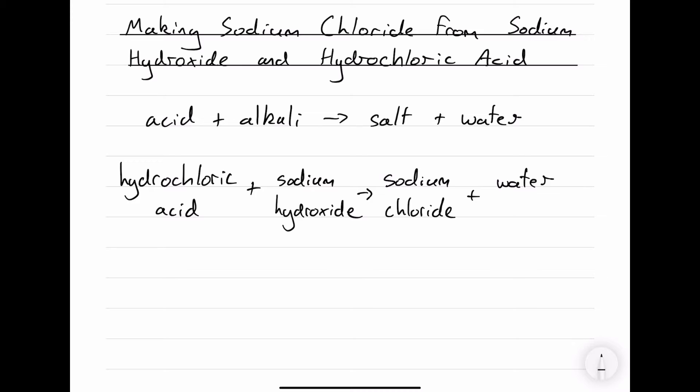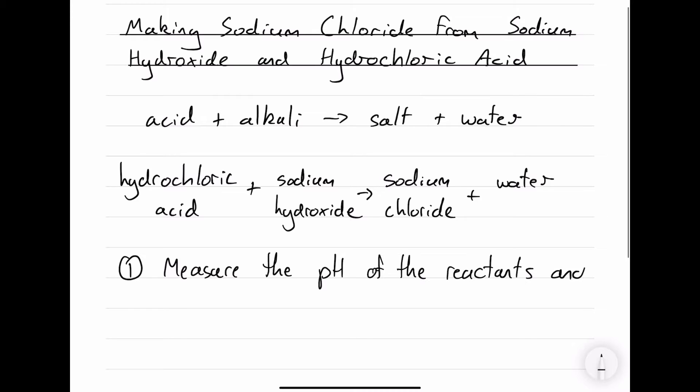First we're going to measure the pH of each reactant and the pH of the products. Then we're going to separate the sodium chloride from the water. Because sodium chloride is soluble in water, we're going to use evaporation.